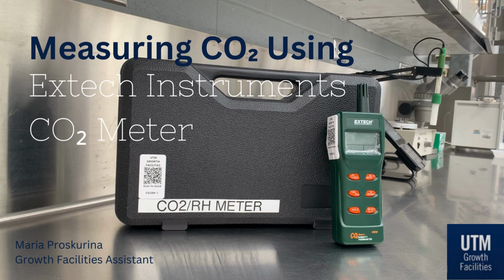This is part 1 of the Extech Instruments CO2 meter instructional videos, and today I will demonstrate how to use this meter to measure carbon dioxide levels between 0 and 5,000 ppm at a 1 ppm resolution. Please visit part 2 to see how to use the temperature and relative humidity features.